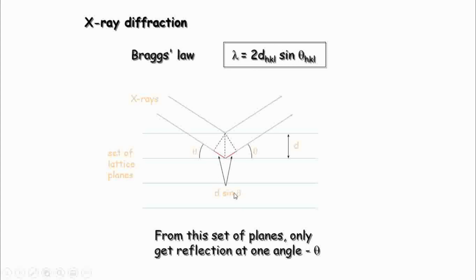So this theta is what is more important, and based on this theta, because d will be fixed, you know the interatomic distance, and the wavelength, this is the X-ray which you are using, so all this part will be fixed. And as I said, HKL is basically the three vectors or three dimensions of the lattice. Like as I showed ABC, similarly it is HKL representation, and then you have the theta in all the three vector sides, which can be pulled together to give you this expression, right?